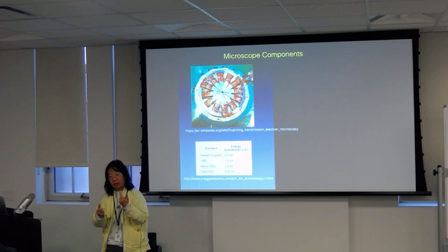But as I mentioned, this is not being used a lot in our field, and it might start to come on. Since now the resolution is getting higher and higher, we have to start worrying about this spread. This is not used as much because the other one is more reliable, more performant. With this, we probably will have to just do something about it every once in a while. You have to basically take that into account when you are doing your experiment. Okay?